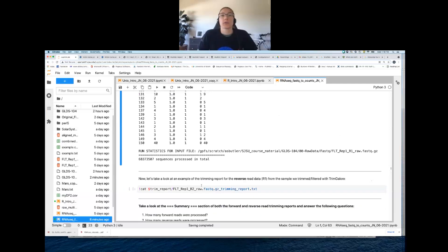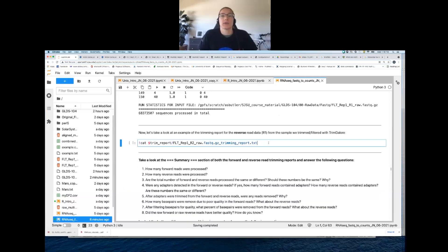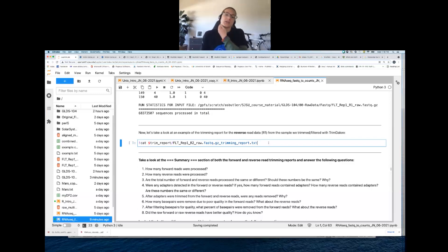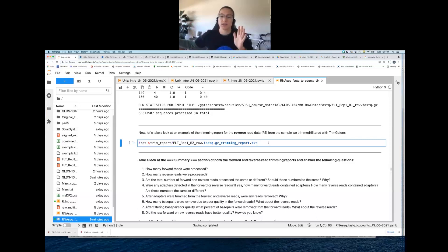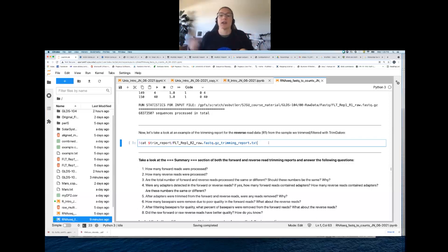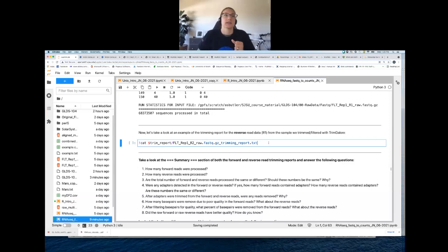Now let's take a look at the trimming report for the reverse read. The insert size was 100 or 150, so it looks at all base pairs up to the longest read — that's why you see it go all the way up to 150 even though the majority of reads are 100. It does want to assess the quality of even the reads that are longer, so that's why you see up to 150.